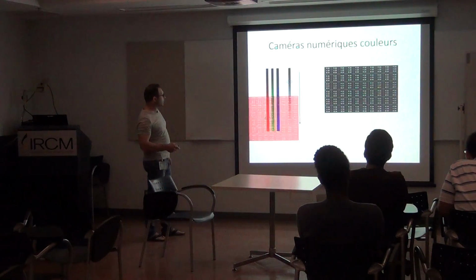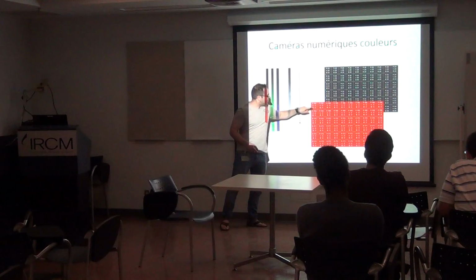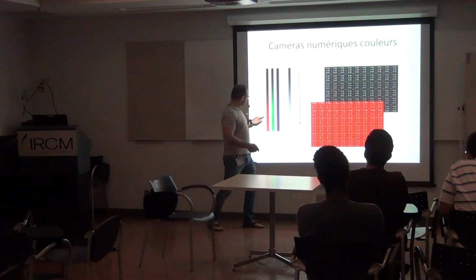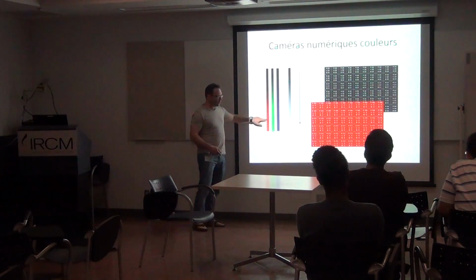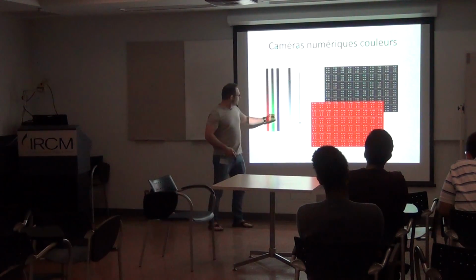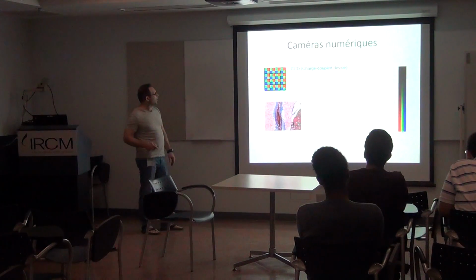And if I get a color image, then I would have for each pixel a red, green, and blue component. If my image is red, so here in that range, I only have red, which has 168, 169, 170, and 173. So this is a high composition of red, but green and blue have 0 value. So it appears only red. And if I get a color image.